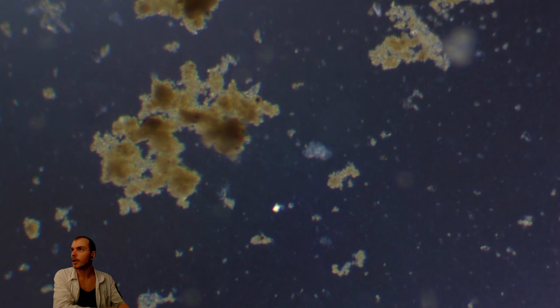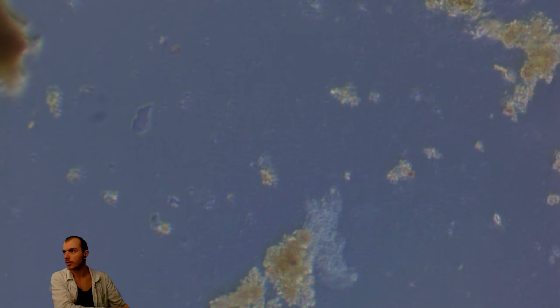So I think I am gonna change the sample. This one looks a little bit like amoeba. I'm not sure. Nah, it's not moving. Looks a little bit like a bacterial colony too, but this bacteria is not moving much.